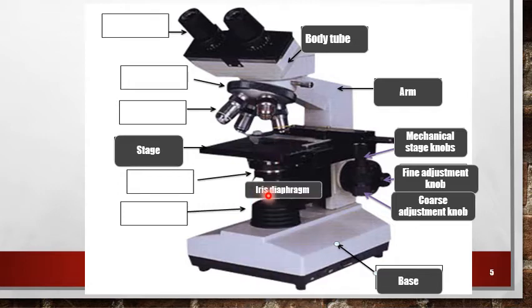Iris diaphragm is located beneath the stage and controls the amount of light which enters the condenser lens.